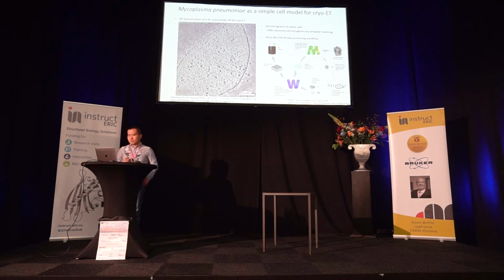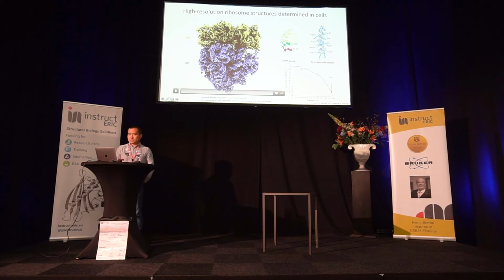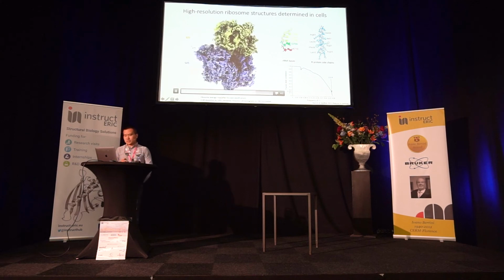Okay, so with the large data and also the new pipeline, we are able to determine the in-cell ribosome structures at 3.5 angstrom resolution inside native cells. And in this structure, the ribosomal RNA base pairs and the ribosomal protein side chains can be well determined.